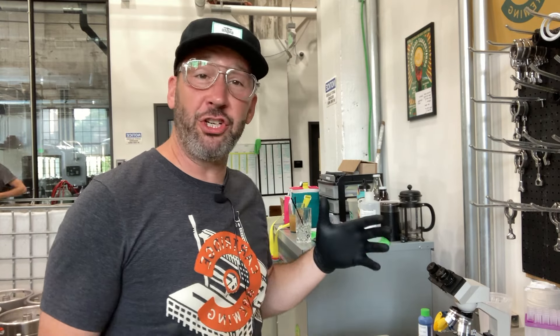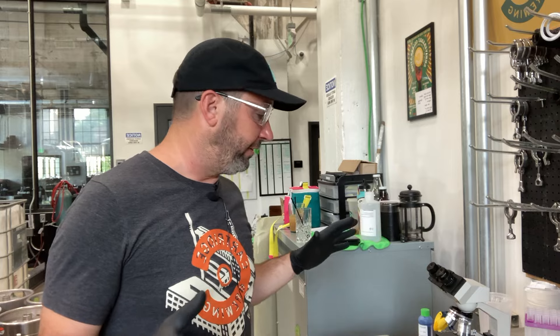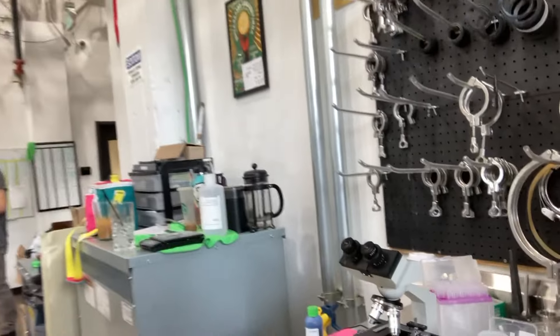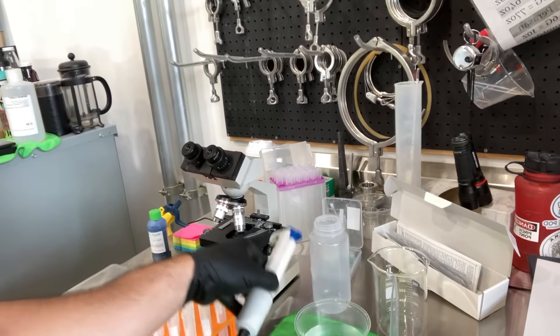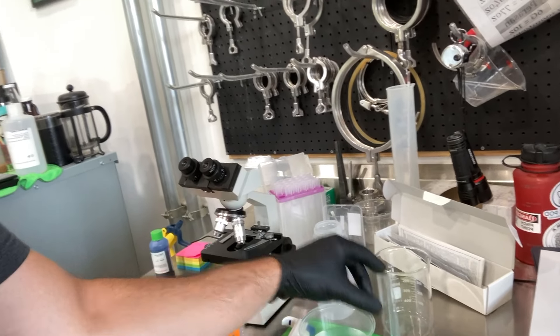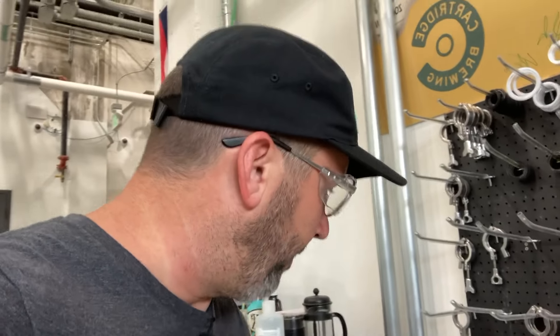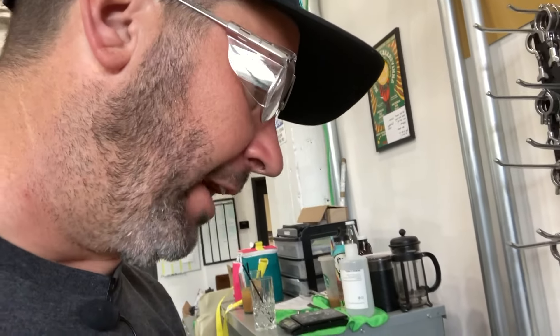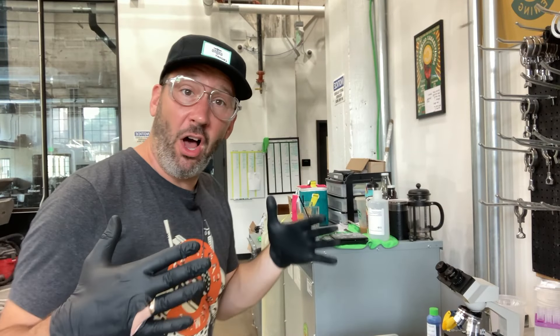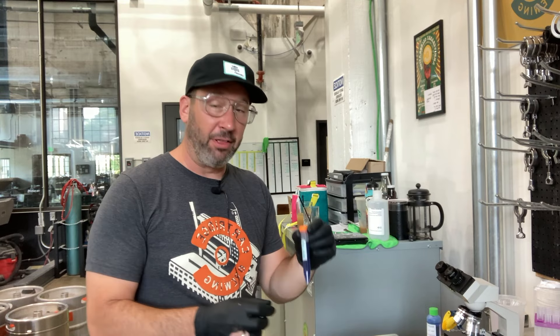I'm gonna kind of show you everything that we're doing. What we want to set up first is our microscope — I might want to be upgrading that with a camera at some point — our test tubes, our water, our jars that we're gonna be harvesting with, the pipette gun that goes with the small ones, test tubes, and also these little cheapo pipettes. I have my hemocytometer here and a little cover slip that goes over that.